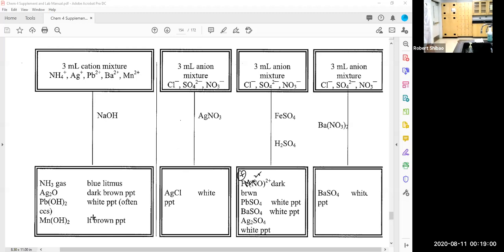Okay. Here we had to do an extra step, but this is why you want to know what's happening, because sometimes you have to do modifications on the fly. It's hard to write instructions for every possible scenario that comes up. The instructions are just a general guide, but the more you know about the underlying reactions and theory, the more you can make little adjustments to make your reactions go a lot smoother.